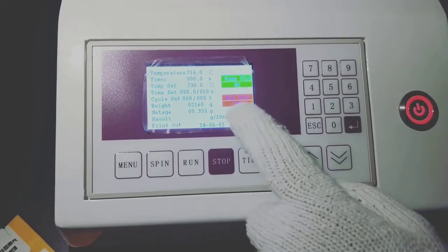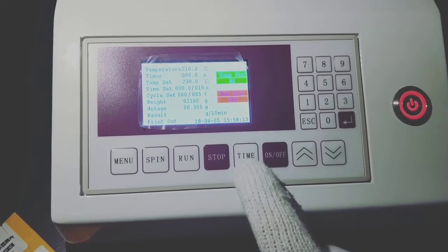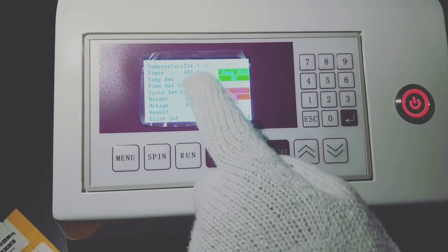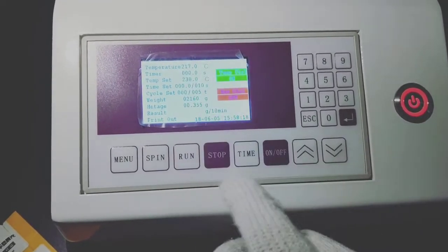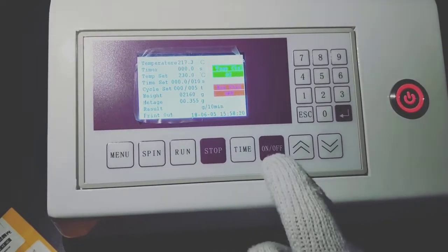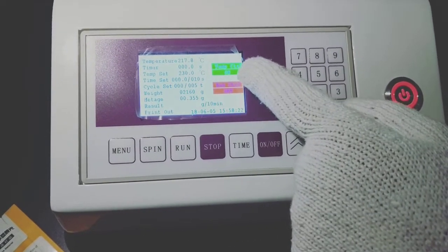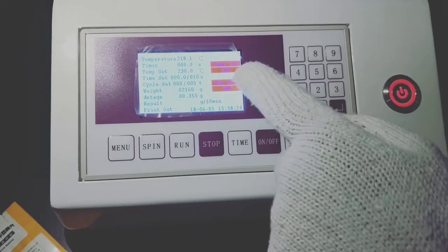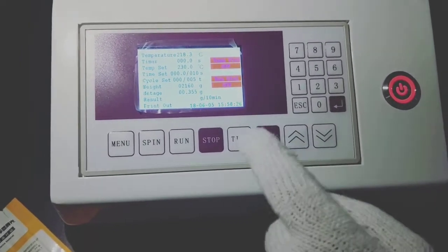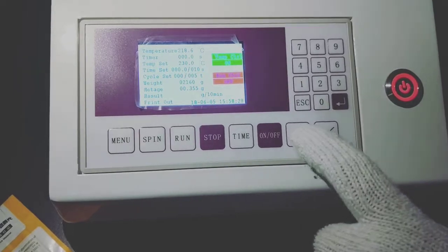Stop. And this time key is used for calculating the 4 minutes keeping time. This on-off is used for controlling the temperature heating. When this red color is off. And this is the moving key.